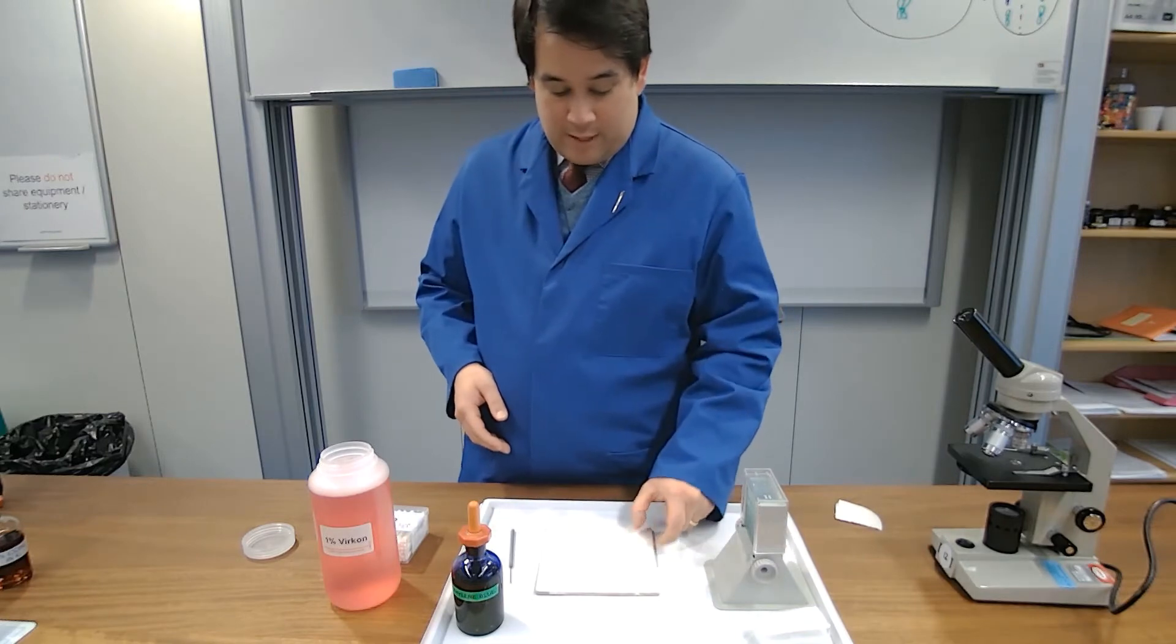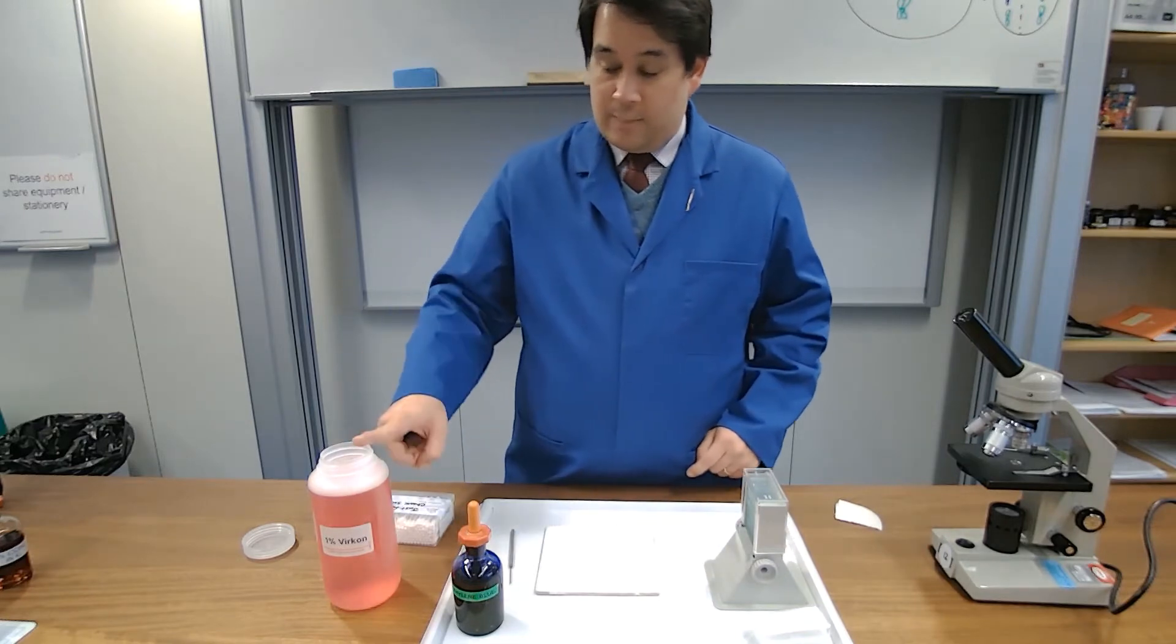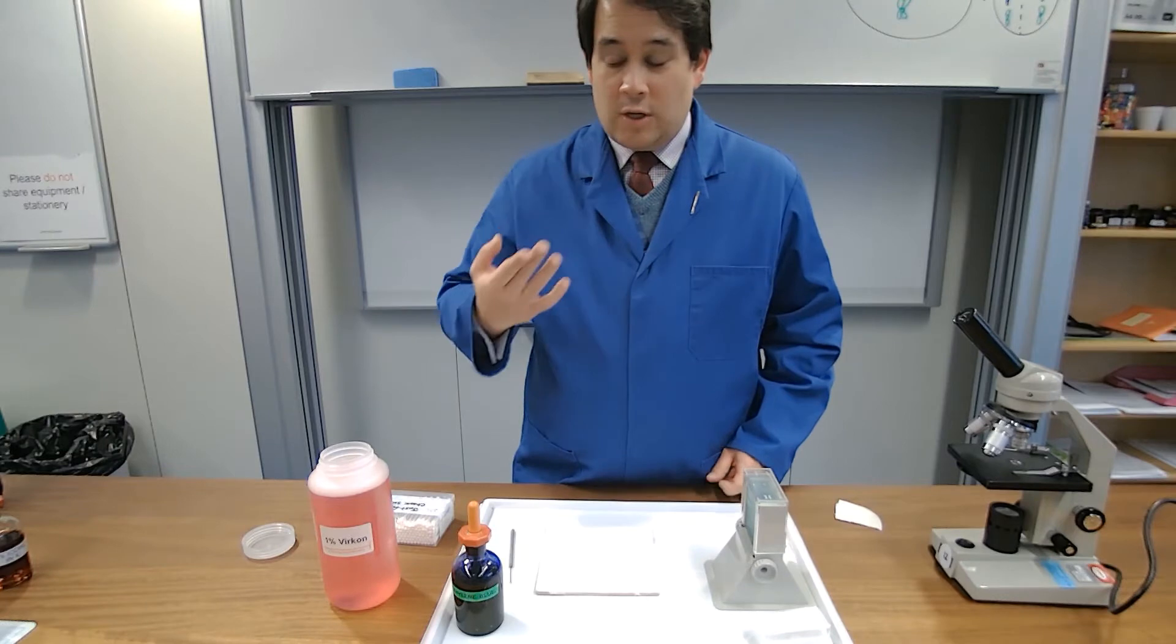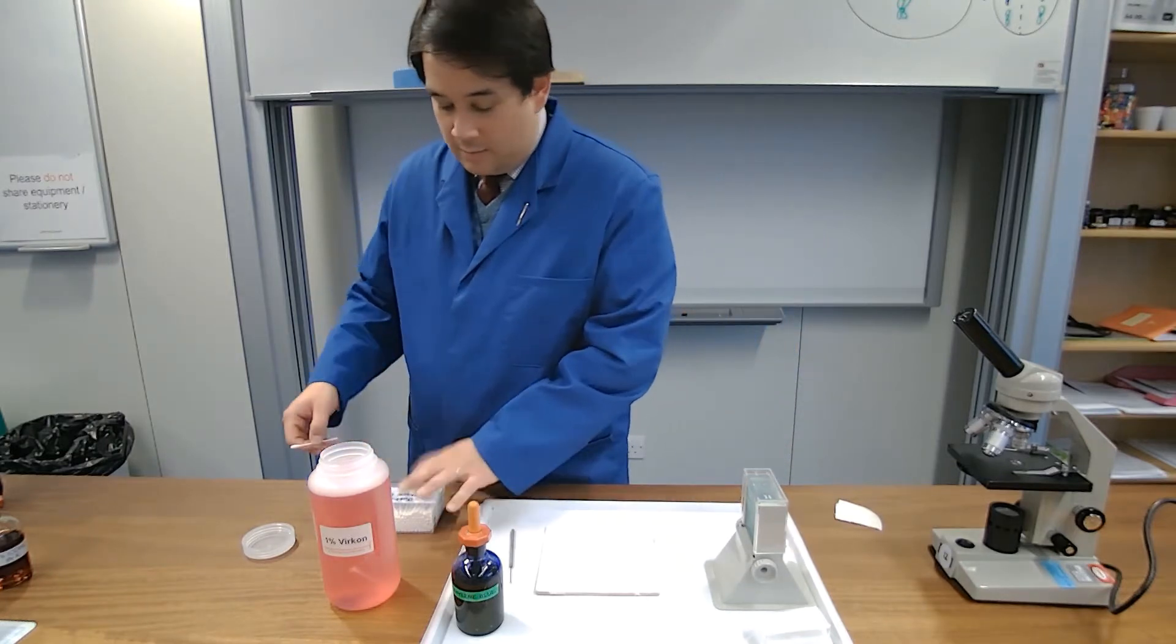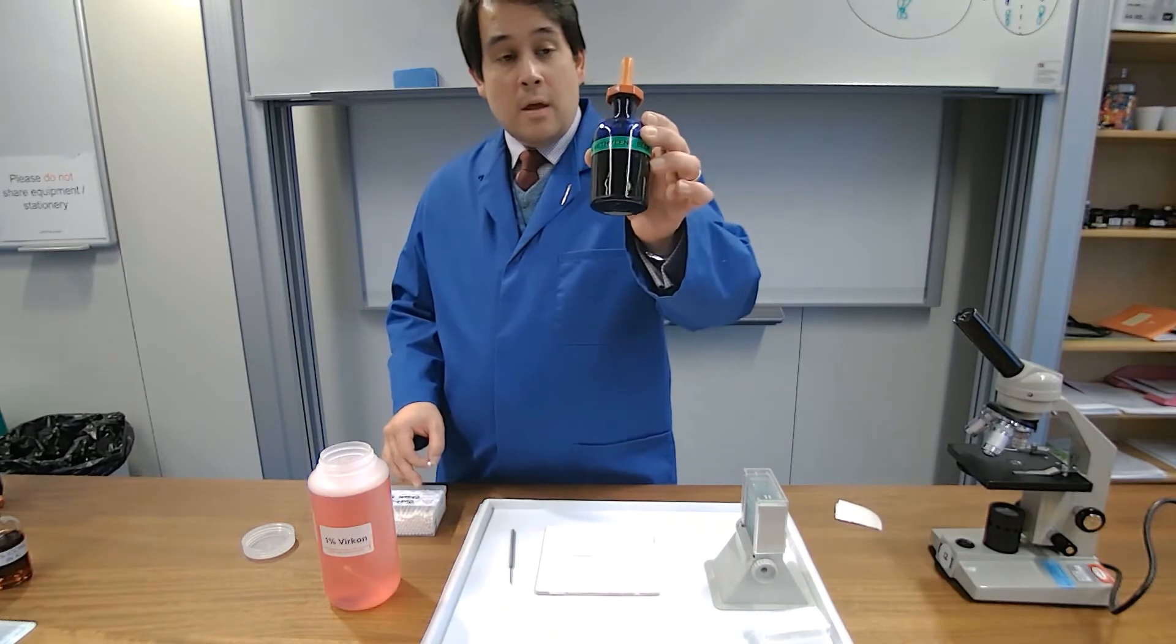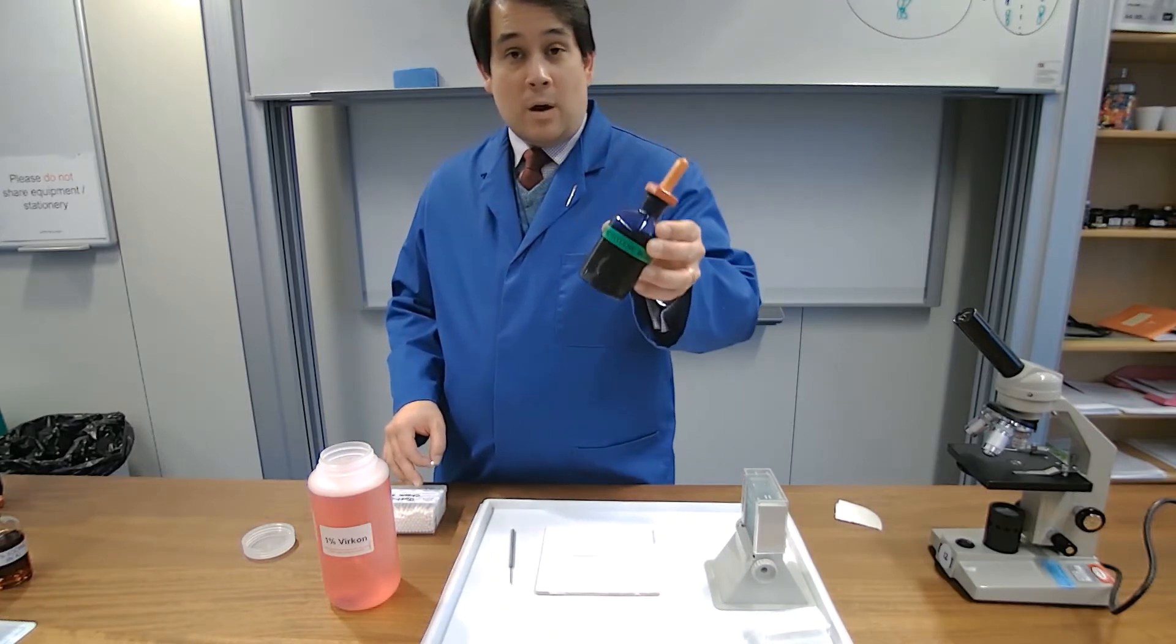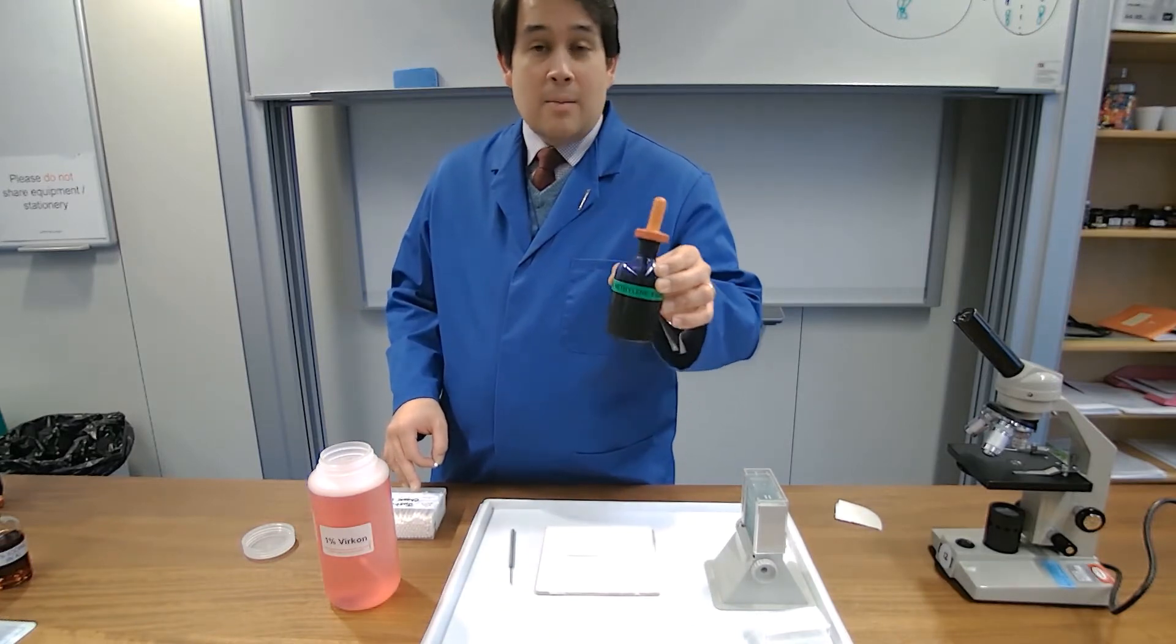So we have a cover slip, we have our slide ready to go, we have some disinfectant because I'm going to be in my cheek cells, and you know, gross, and then after that we have a stain, which we will use to make what are pretty much transparent cells become a bit more visible.